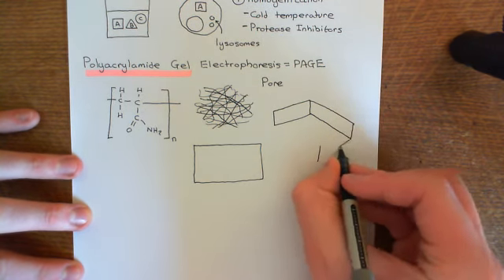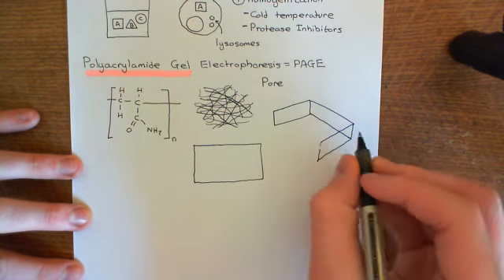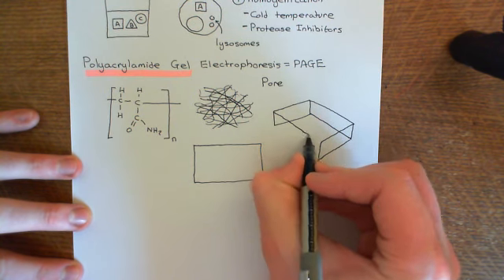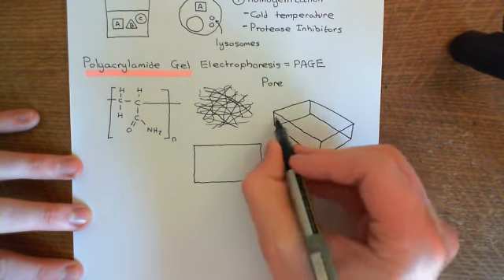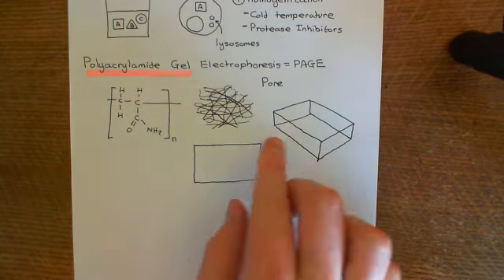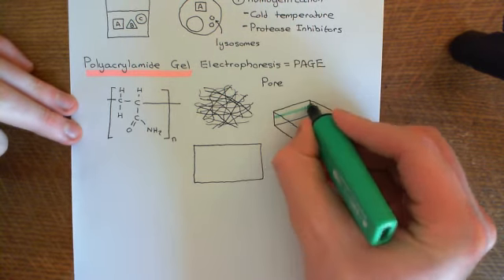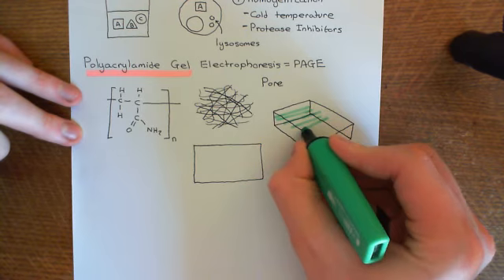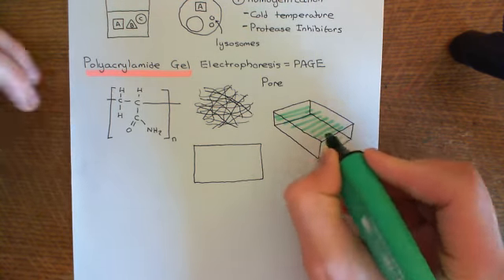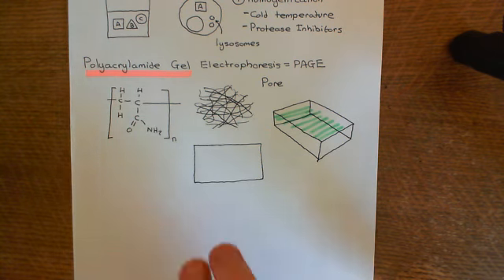So you have basically a nice little glass tray here, and you're going to put the polyacrylamide gel into this tray, and you'll have a rectangular surface of polyacrylamide gel then. The gel will be in this glass tray basically. You might take it up to this sort of level here, so you'll have polyacrylamide gel in here, like so.